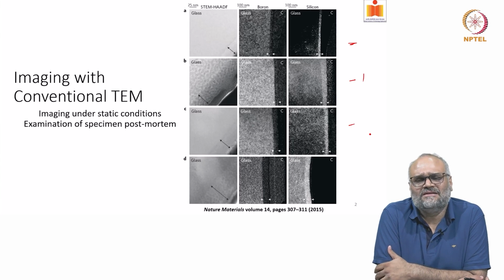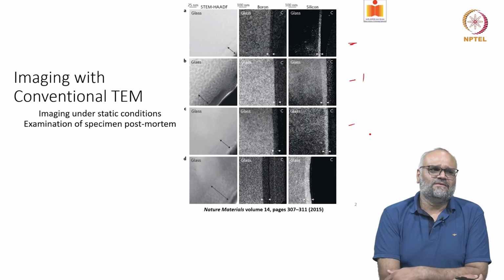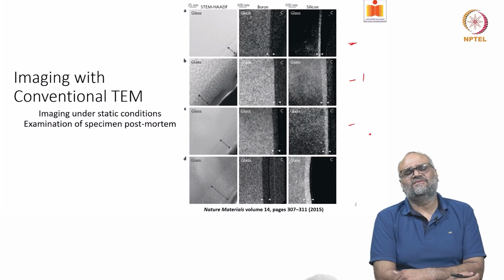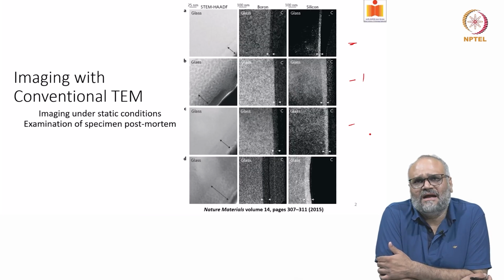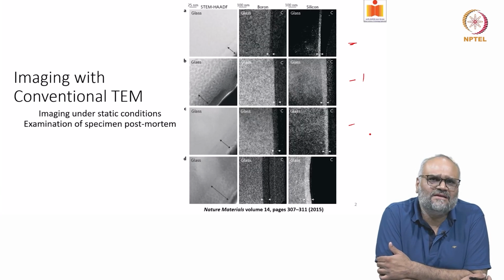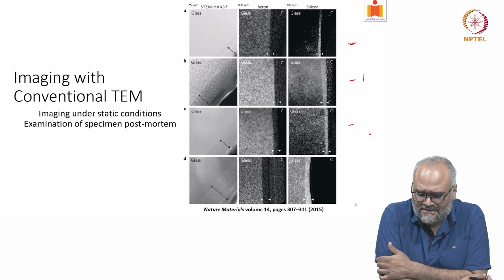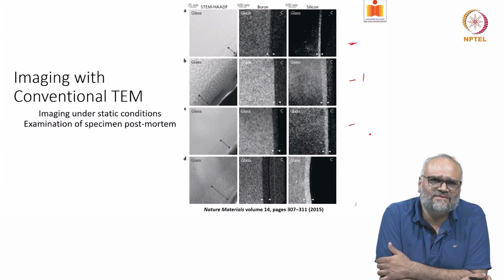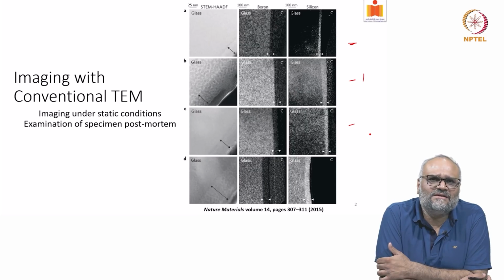One would not expect much changes in glass which is very stable, that too in presence of water, but there is an interesting mechanism that is observed called dissolution and reprecipitation, which happens at the glass-water interface, and there is formation of so-called phyllosilicates, and they start appearing like fibrous kind of layers at the glass and water interface, and because of this there is a sort of a new mechanism of corrosion of glass as well, and this was possible to study by using STEM HAADF and combining with energy filtered TEM mapping.